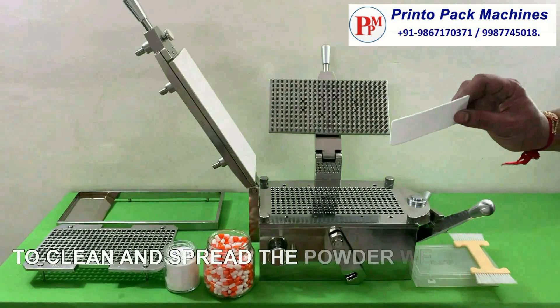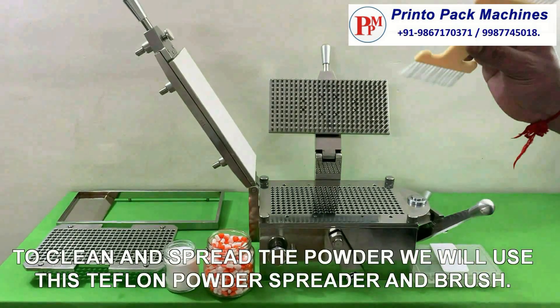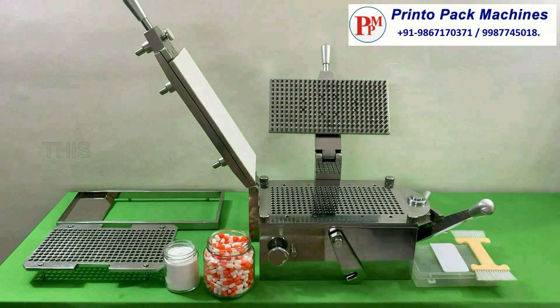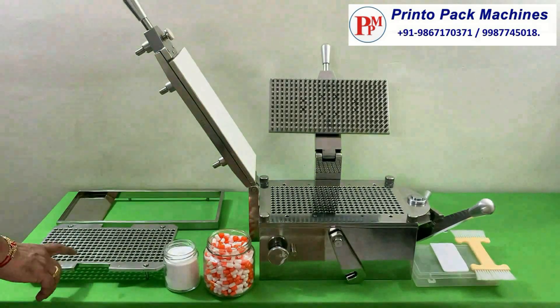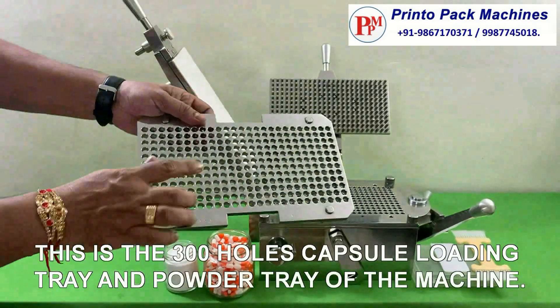To clean and spread the powder we will use this Teflon powder spreader and brush. This knob is used to lock and unlock the capsule loading tray while filling. This is the 300 holes capsule loading tray and powder tray of the machine.